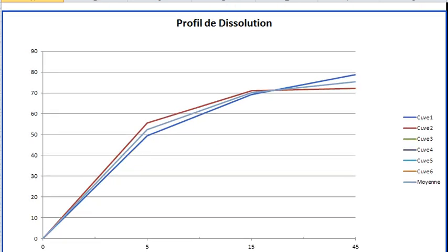The graphic automatically displays the curves for vessels 1 and 2 and their average.